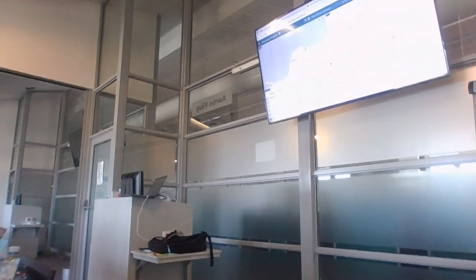You just get to a terminal. So, let's go back to the web browser. I wonder if it's a problem of... I have never worked with this thing.